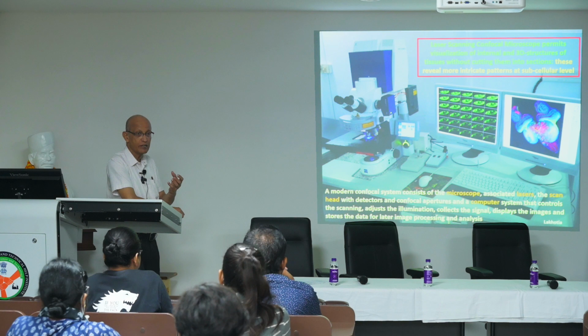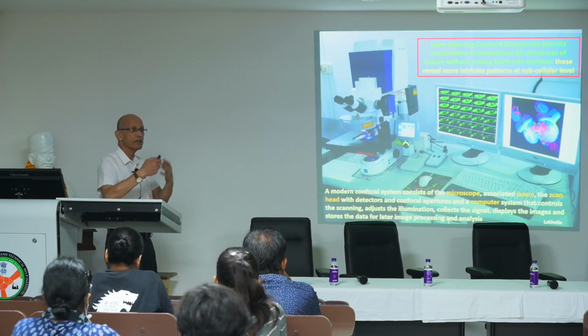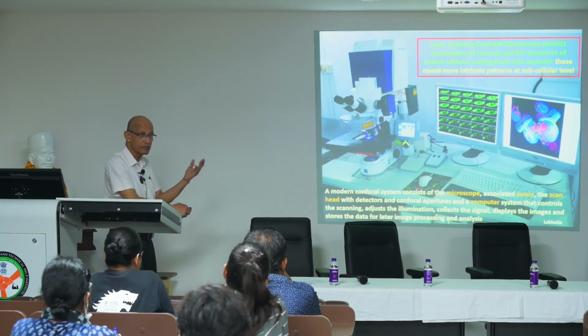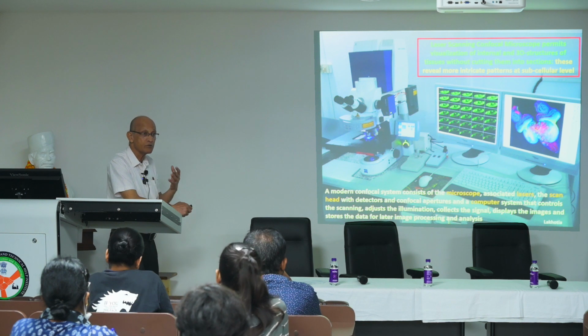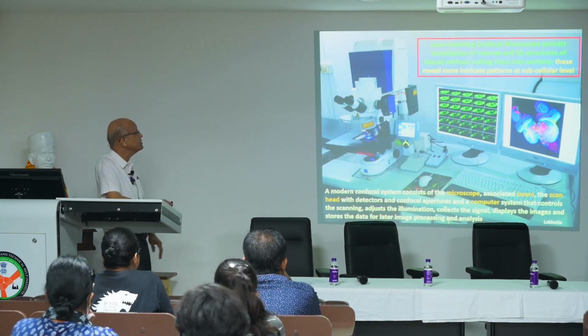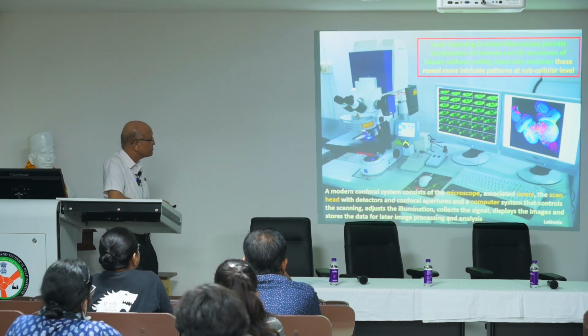There's software and a high-end computer that is required to generate the data, collect the data, and control everything in the microscope. It can have a standard camera as well to collect the images, but confocal images are not collected by this. They are collected by the photosensitive system, photomultiplier tubes or spectral detectors or whatever it is. They are built in the scan head. I'll try to explain the anatomy of this part later on.